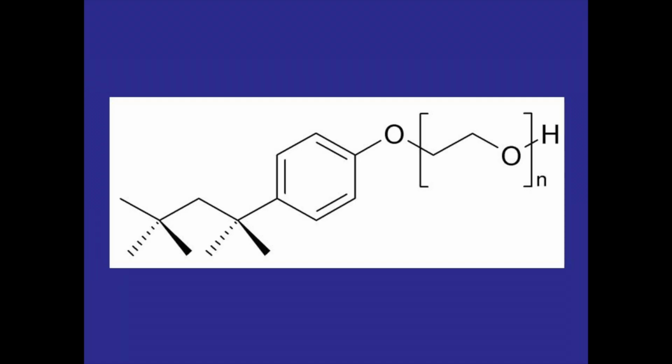Here's a look at that compound. The n here represents a given number of ether groups attached together in a chain. So for Triton X45, there would be on average between 4 and 5 ether groups attached together. And with that many oxygens, Triton X45 is pretty water soluble, so it won't contaminate the cinnamaldehyde water distillate that comes off during the steam distillation process.